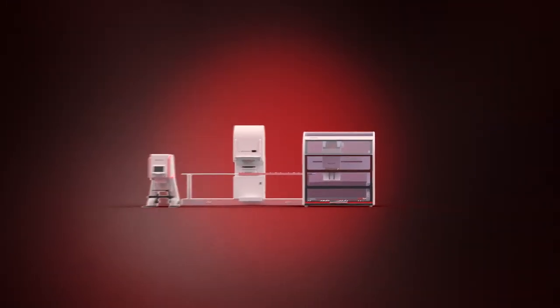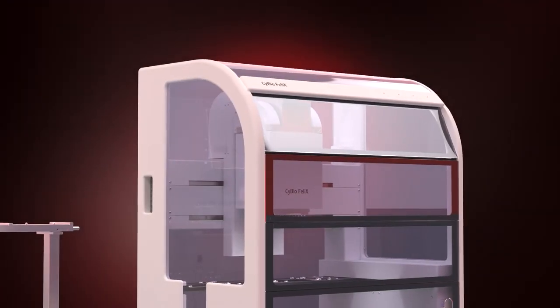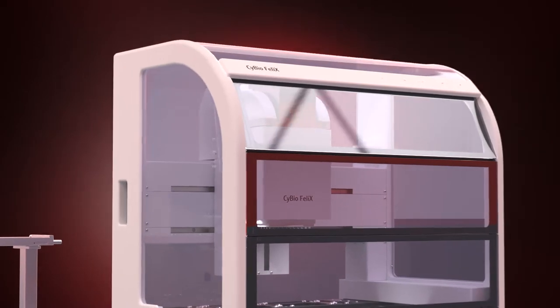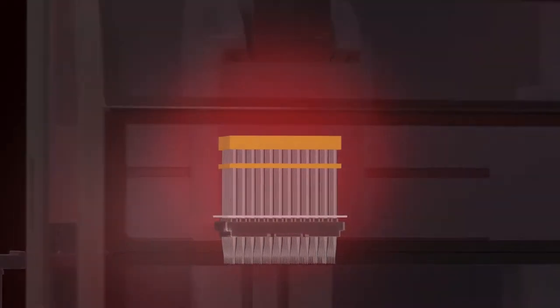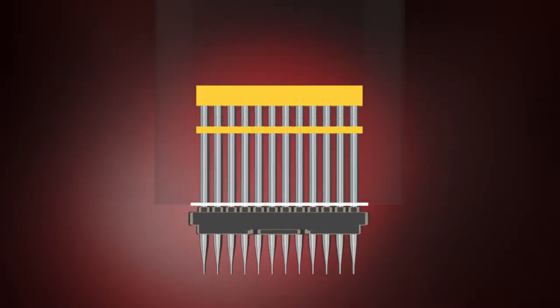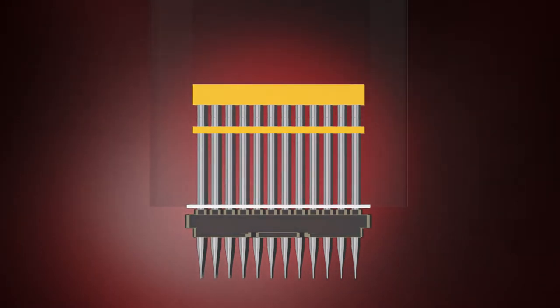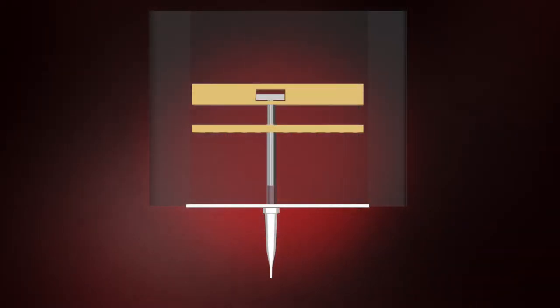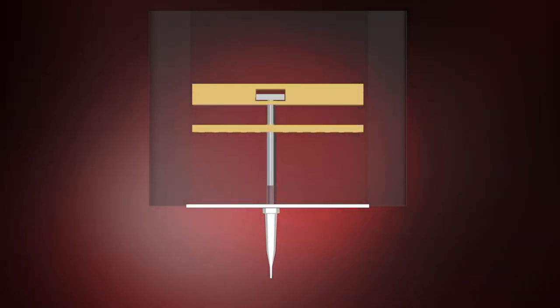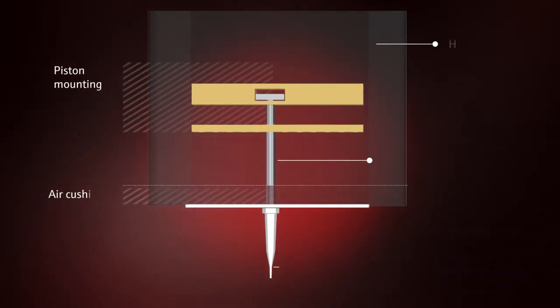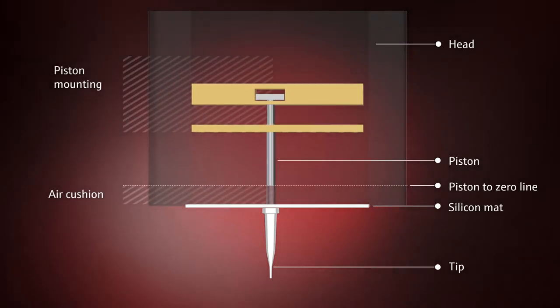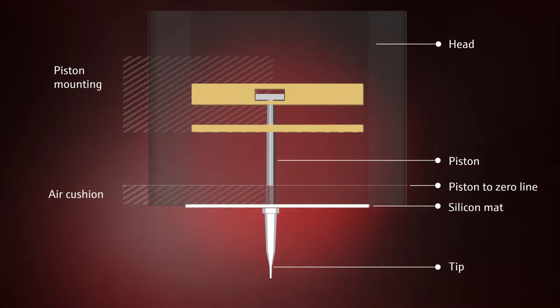Analytic Jena's liquid handling platforms use the same pipetting technology. The patented tip sealing technology is proven in high throughput precision and reliable pipetting results in the pharmaceutical and life science industries. This graphic shows the mounting of the pistons in the head, exemplarily by only one piston.